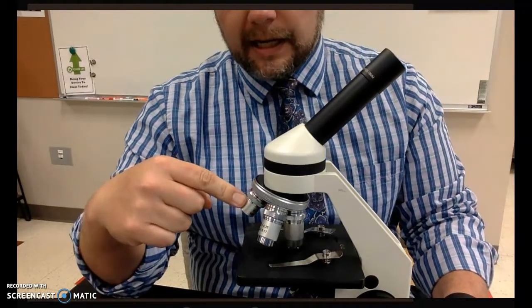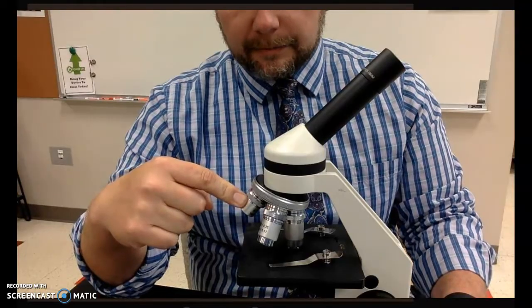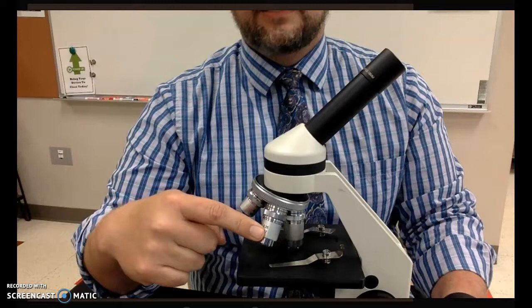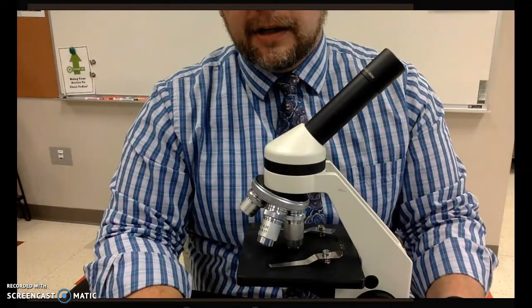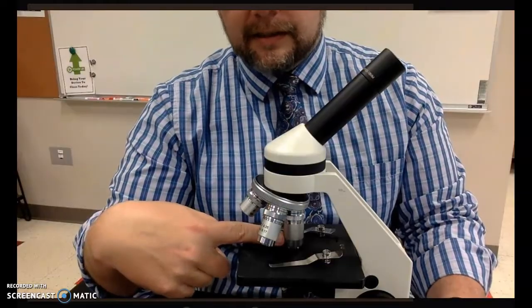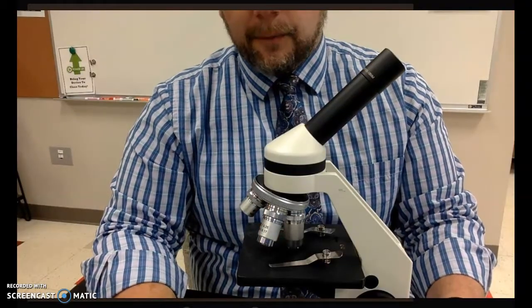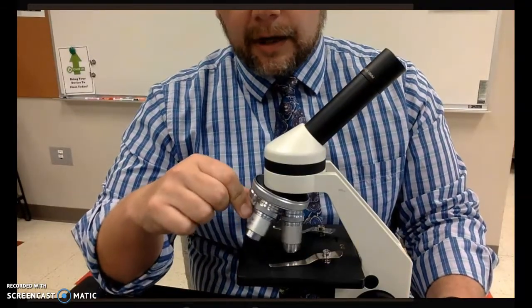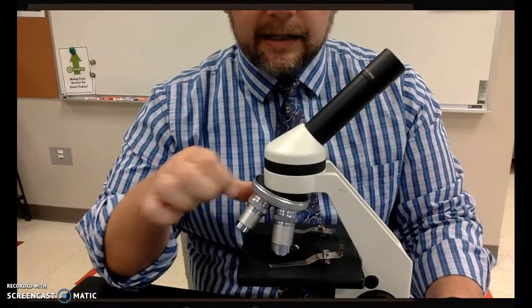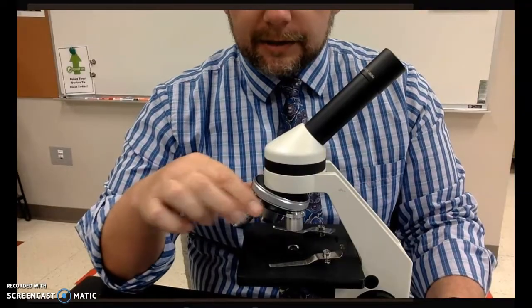The smallest one has a magnification of 4x. The middle objective has a magnification of 10x, and the largest objective lens has a magnification of 40x. Whenever you are using a microscope, they will always show you on the outside what the magnification is.